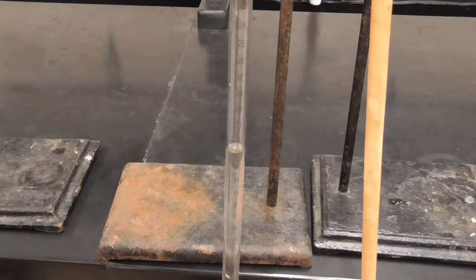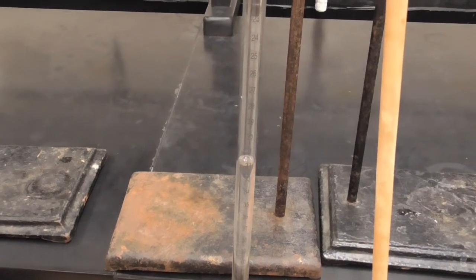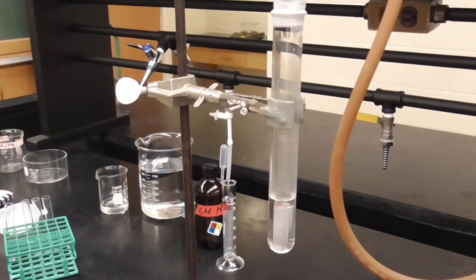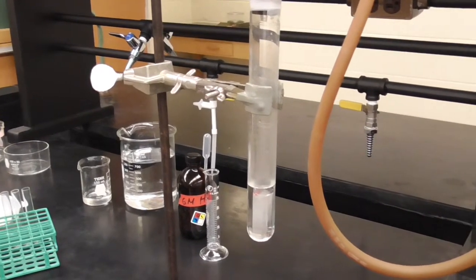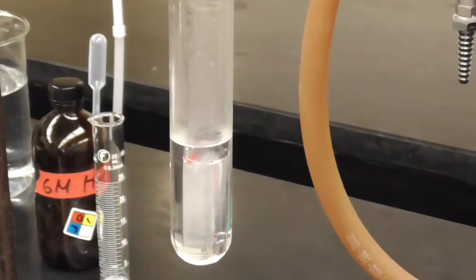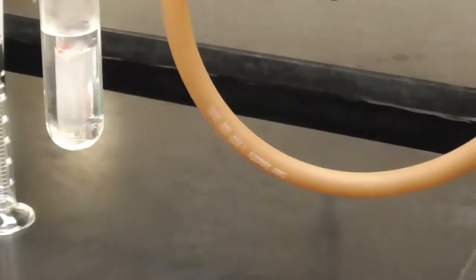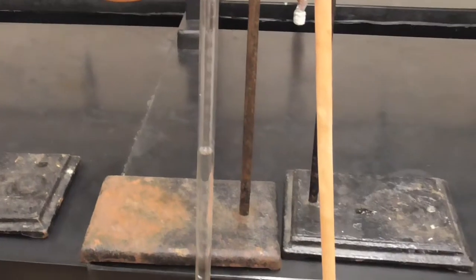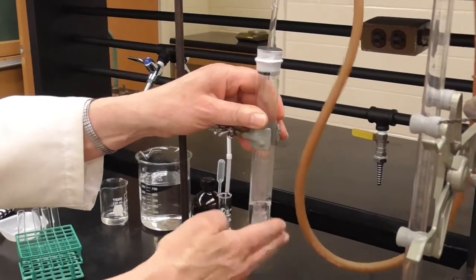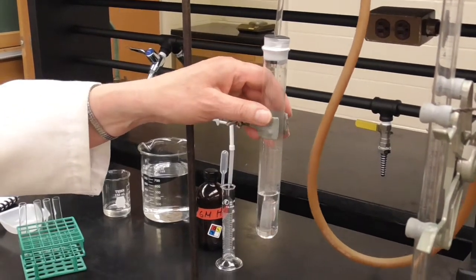And so we're probably almost there at this point, in that the reaction has slowed down quite a bit, and it looks like the level in the burette has quit changing. I'm going to just give a little bit of a tap to this to make sure that we've got all the hydrogen out of there.